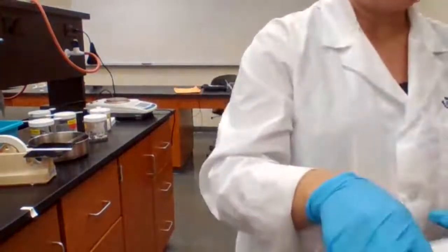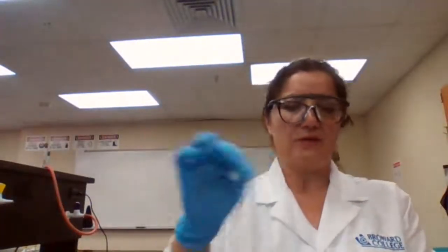And compare the effect of temperature also. You saw the white crystals happen right away, and then it took some time for the black crystals to form. The formation of the black crystals was part B of the reaction. Formation of the white crystals was part A of the reaction. And we did part B again in hot water. We tested part B in the hot water.